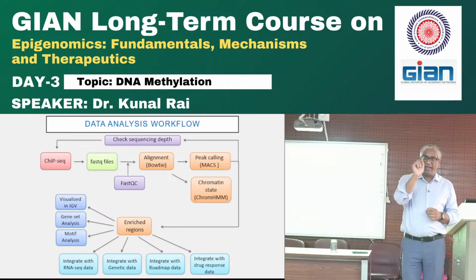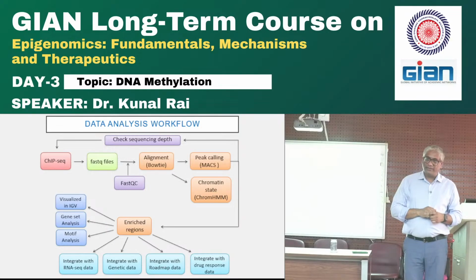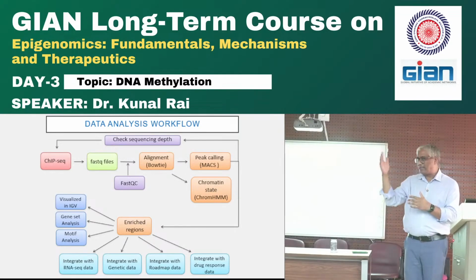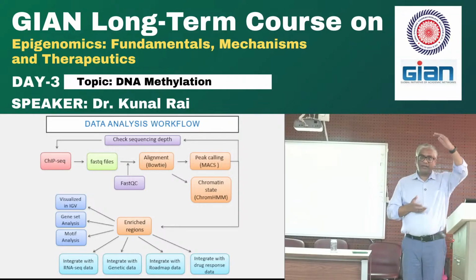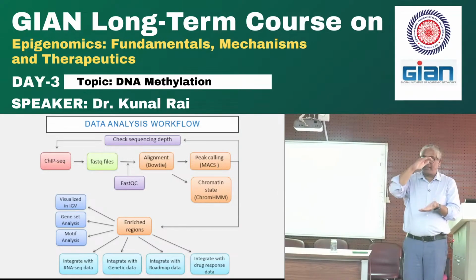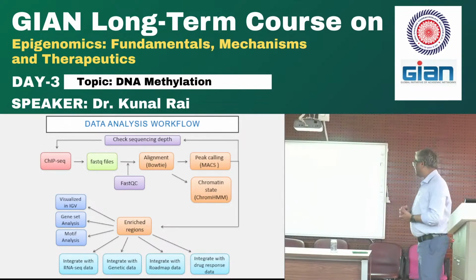And then I put it out there. So my software puts the peak there. It says there are X number of piled reads here, and those piled reads make this peak. Maybe there are 500 piled reads, so the peak will be tall. Maybe there are 30 piled reads, so the peak will be smaller. Okay, you get it? That's how peaks are made.